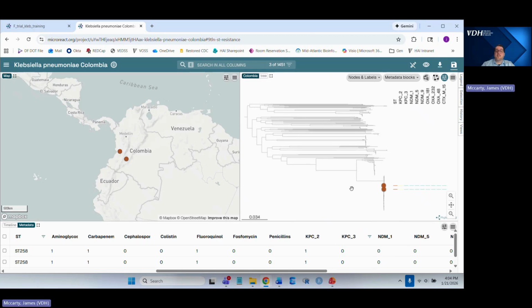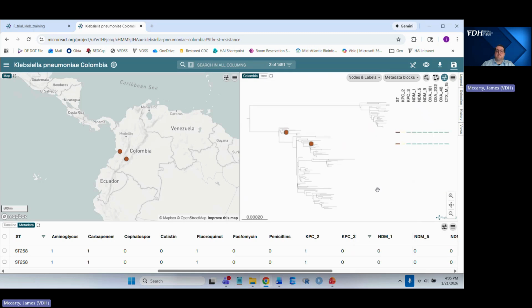As you can see, this really cuts down on the number of cases on the tree. So one tip to get a better view, because it's all smushed in there: if you hover over the line further to the left over here, you can see this circle appear. And when you see that circle, right click on your mouse, not left click, and this menu will pull up. You can click view subtree, just left click on that like normal. And then it'll redraw this tree, so it's more zoomed in on the nodes of interest.